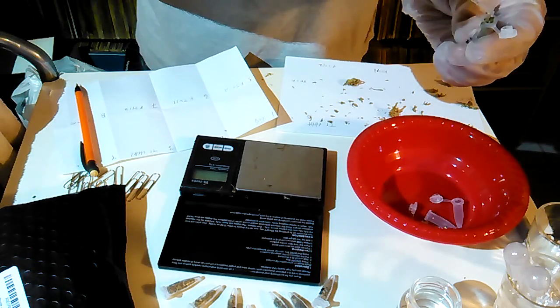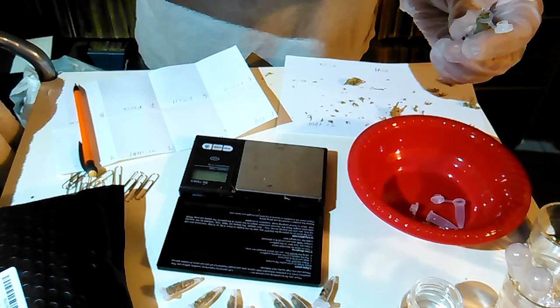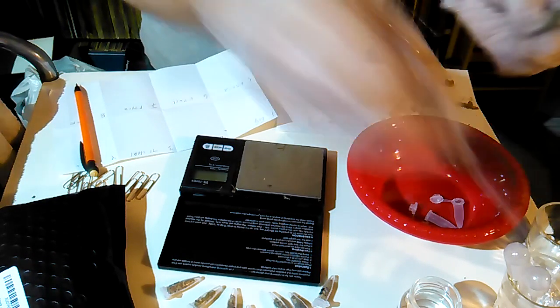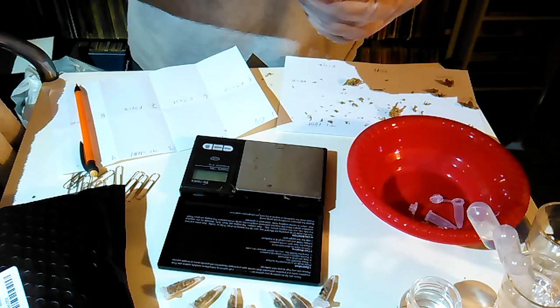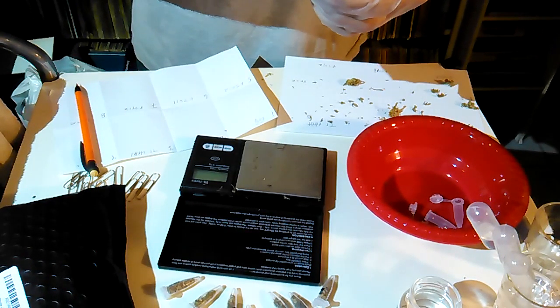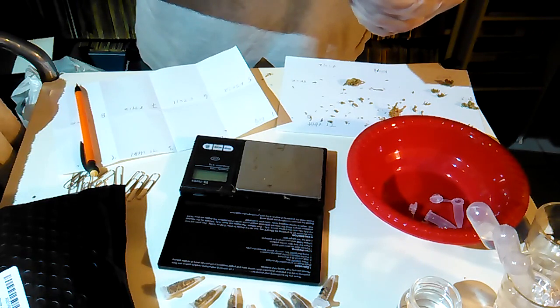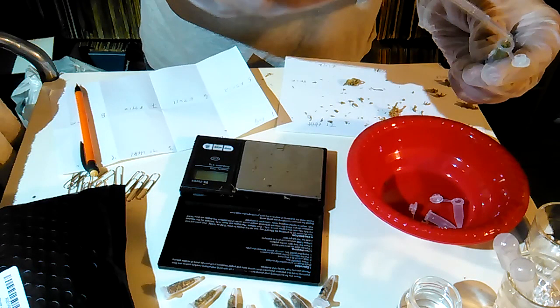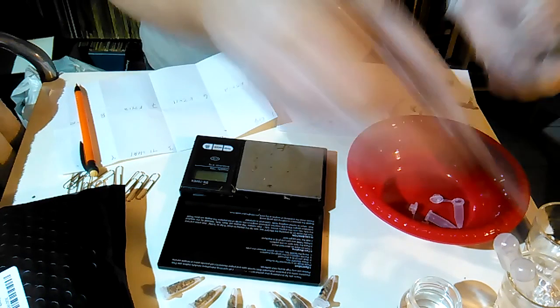And you want to be a little careful not to suck stuff back in and then contaminate the shot glass, because if there's high CBD, you're going to get it in all the others. So this one's more of a trouble than most, but I'm going to keep dripping it here. Alright.